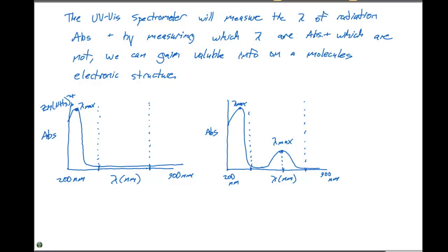now that we know that these bumps are there, these absorbance peaks are due to electrons being excited. The question now is, which electrons are excited, and how are they moving throughout the molecule? So I kind of gave you a background of the energy part of this stuff. But now we have to go back, and I said there's 2 things that you should pay very close attention to.